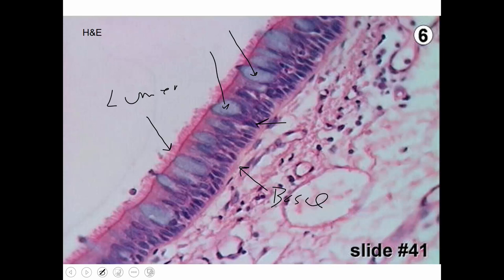Now, if it's not picking up the stain, why is it not picking up the stain? Is it because it's not there or because something is preventing the stain from binding? What's the answer? The latter. In some cases, you may have preparations where there are artifacts where the entity has been lost, or in some cases like this, the entity is there, but something is preventing the stain from binding. In this case, these are goblet cells. These are granules containing mucin, and mucin is a heavily glycosylated protein. And all those sugar groups are preventing the stain from binding.